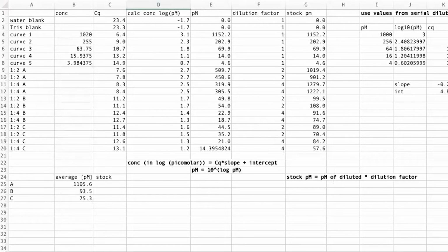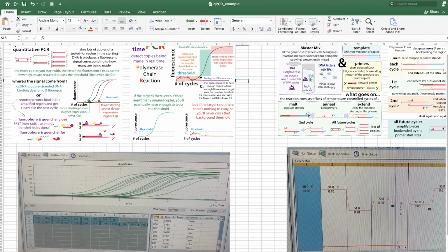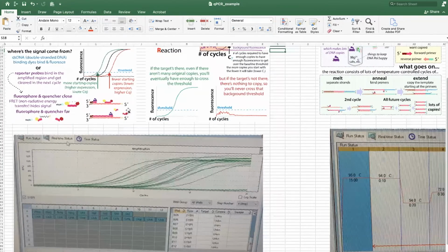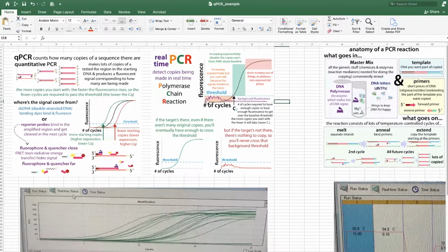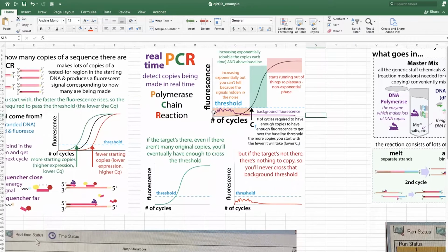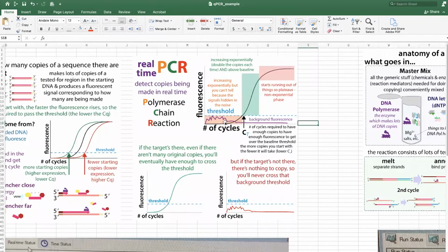And so now let's look at how we use those results. If you look really early, you're going to be like, oh my God, did I do something wrong? I don't see any signal. Don't worry. That's what's supposed to happen. In the beginning, you're below the detection limit of the machine, so you need to wait until you actually get above the detection level of the device.